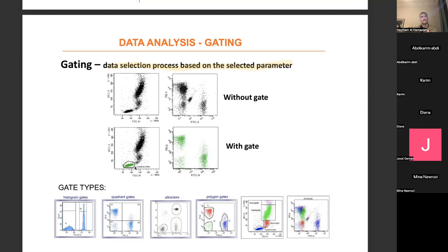Now we want to see, of those lymphocytes, which ones have a specific antigen. How did these separate into these four populations? They took those four populations and worked with them on this graph. Let's say again, CD4, CD8. We separate those orange or green labeled cells into populations that are plus plus, plus minus, minus plus, minus minus. In this case, it only has CD4. In this case, it only has CD8. In this case, it has both. In this case, it has neither. So we took those cells and worked to see which ones have that antigen. Easy? So what's gating?